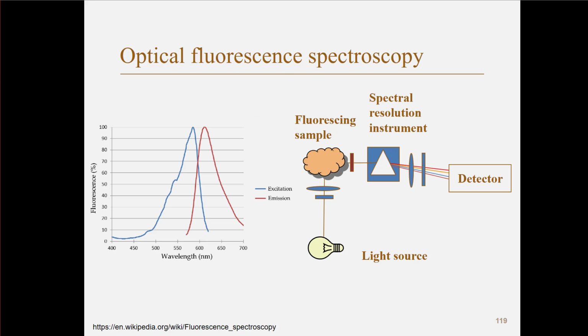Another kind of spectroscopy is, and now I have moved the light to show it a little more carefully, I mean, it doesn't necessarily have to be seen from the side, fluorescence spectroscopy. In this case, you take a light source which is not so broad, which you shine in, and often you do it from the side like this, because that means the light continuing out here goes in this direction, so not so much light is scattered in the sideways direction.